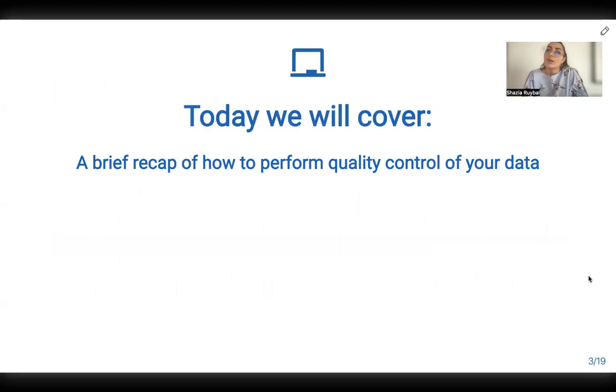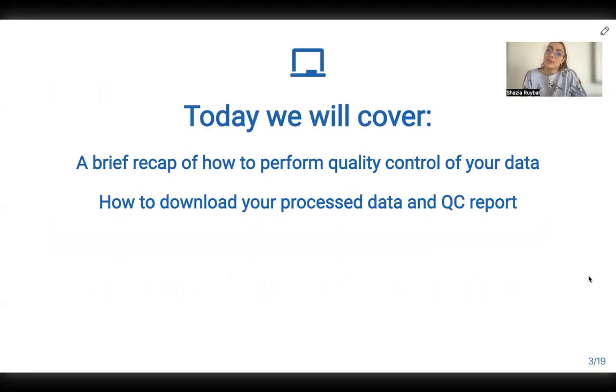So today we're just going to go over a recap of how to do the QC and how to download your process data and QC report.